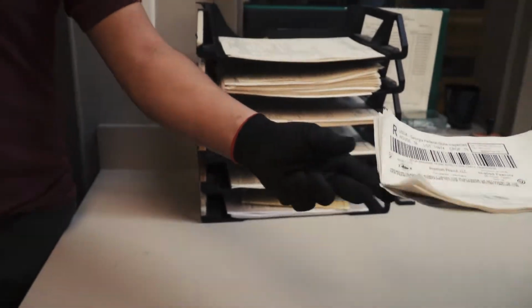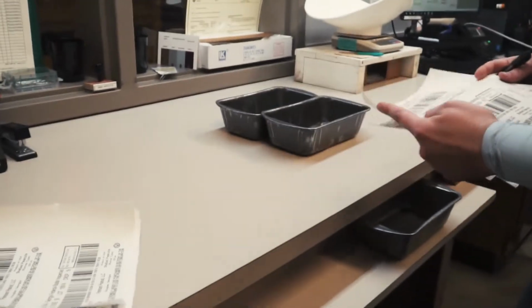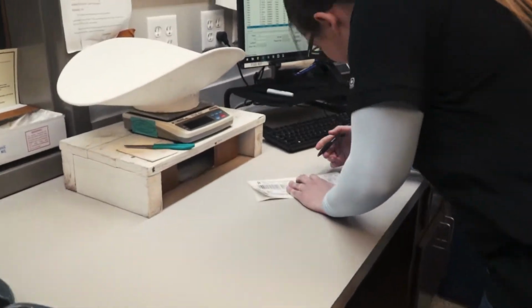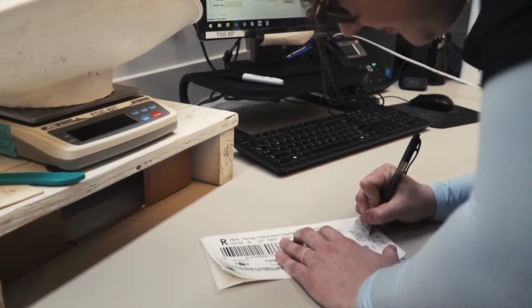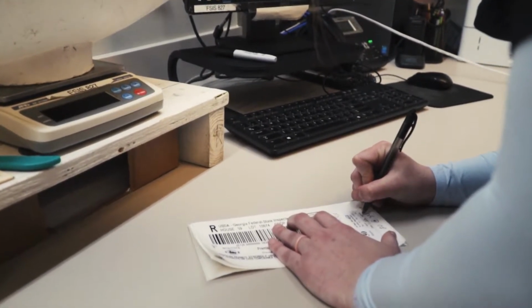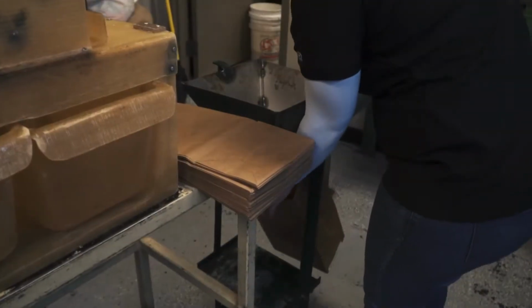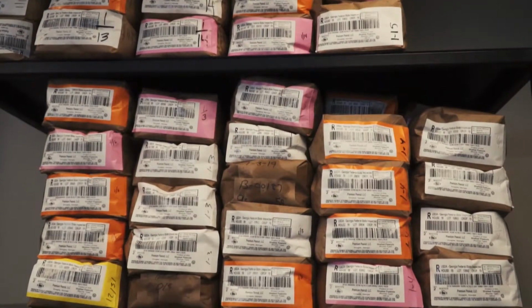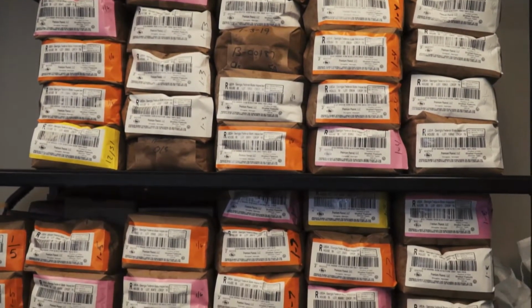Before the packaging process of a lot begins, the tags are brought into the on-site FSIS grade room. The inspector records the time and date on the control tag that accompanies the grade certificate when it is delivered to the FSIS district office. A second tag is placed on the bag that will hold the check sample, which is retained for 15 days after the lot's production in the event that it is requested for the original inspection to be reviewed.